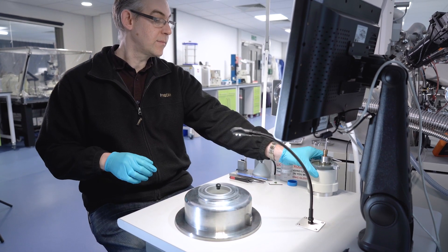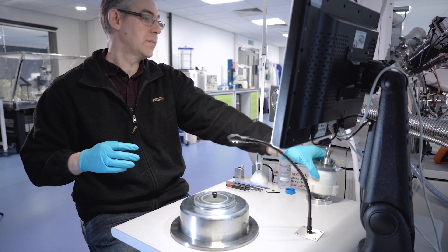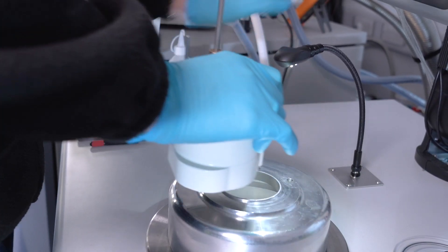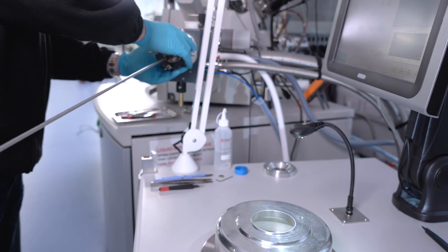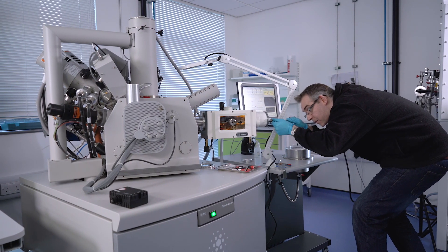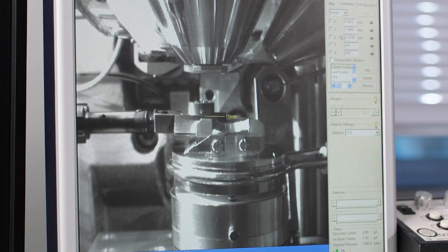The advantage of using an on-column system is the speed at which you can prepare your samples — coating, fracturing, sublimation, and so on. You do one airlock operation and your sample is immediately in high vacuum and never leaves that high vacuum. With an off-column system, you are continually doing airlock operations and transferring between different preparation areas, and there is always the risk of contamination.